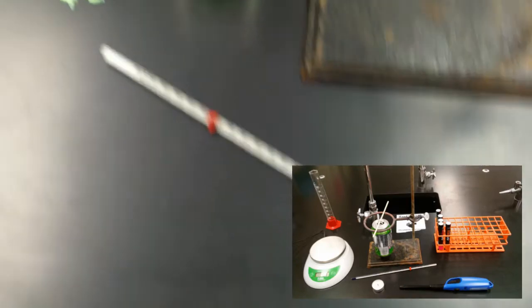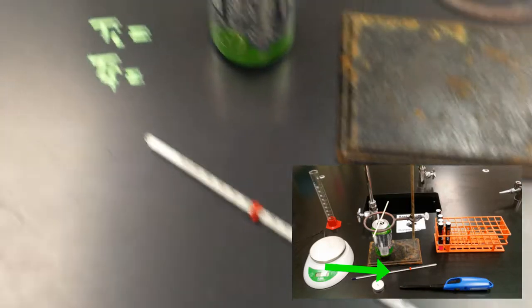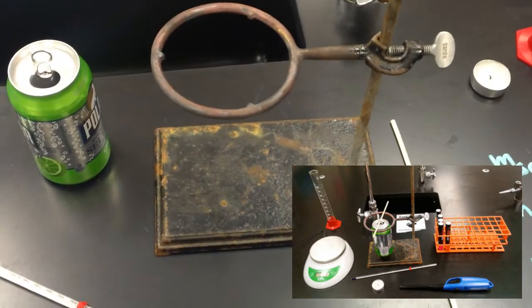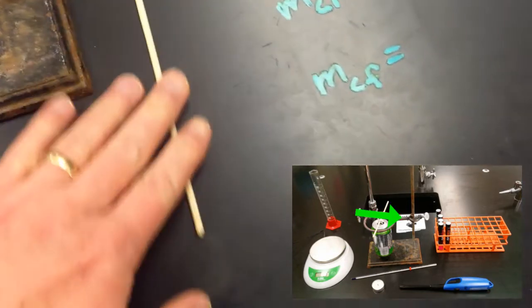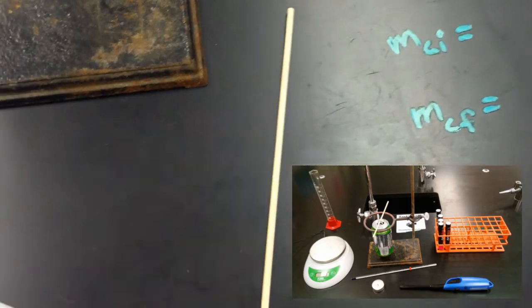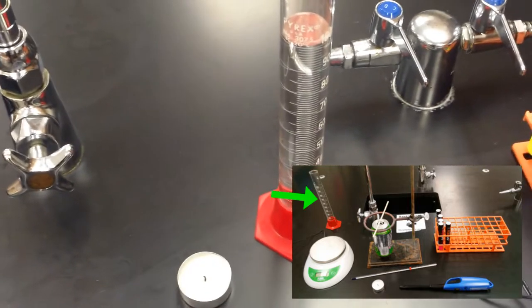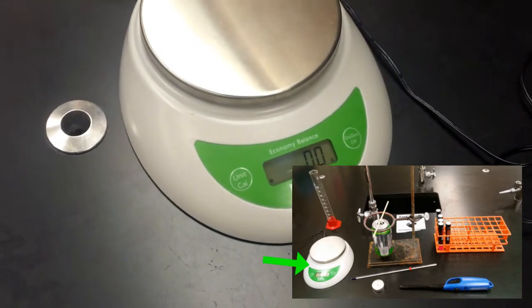Okay, so to do this experiment we need a thermometer, we need an empty soda can, we're going to use a ring stand, I've got a portion of a bamboo skewer that I'm going to use, a tea candle, a graduated cylinder with 100 milliliters of water, and an electronic balance.